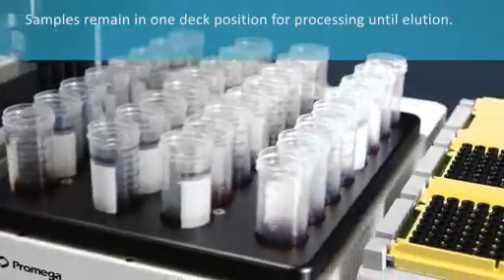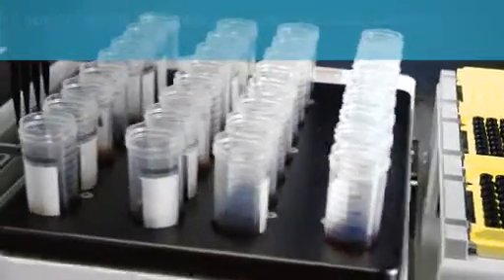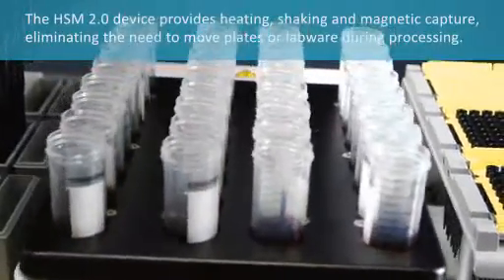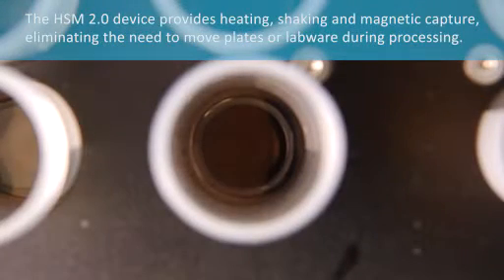The HSM 2.0 device provides heating, shaking, and magnetic capture, eliminating the need to move plates or labware during processing.